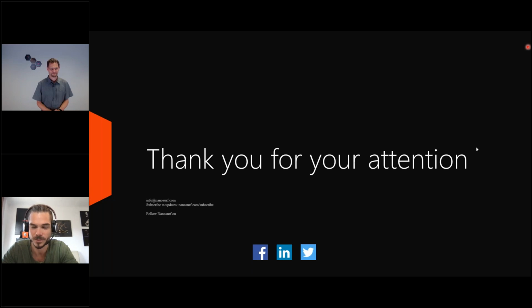And this is half a follow-up actually. How would I know whether my sample requires in-plane or out-of-plane analysis? That's a good question. It's probably trial and error. So I would normally start with the out-of-plane measurement and see whether I have my response there. And you can then always also look at the in-plane contribution.